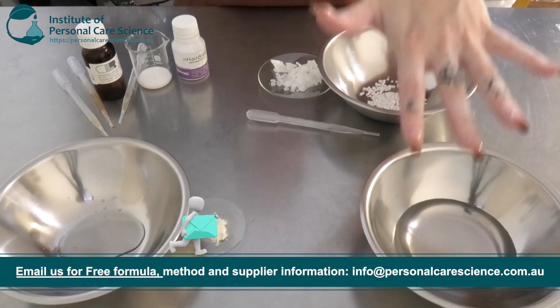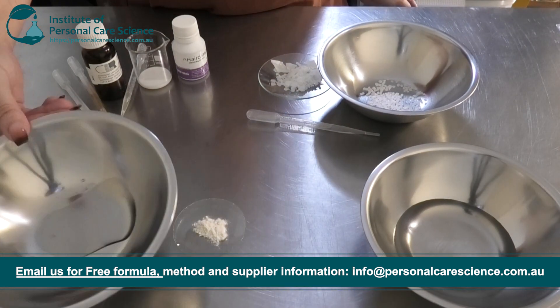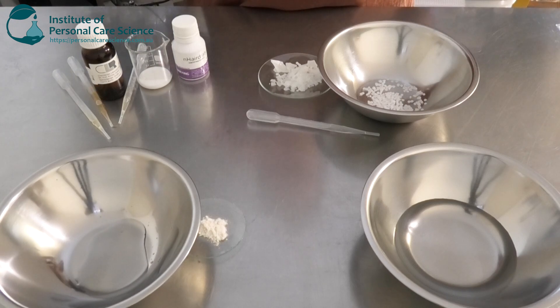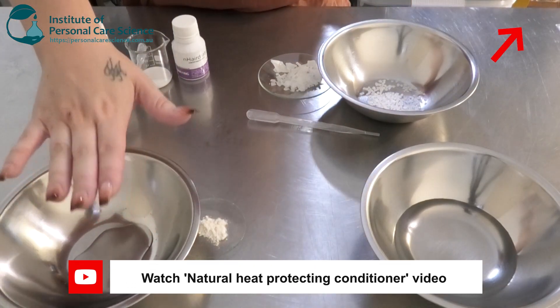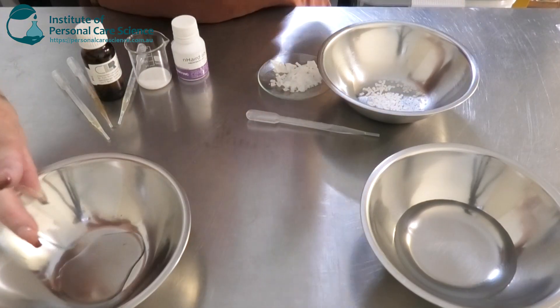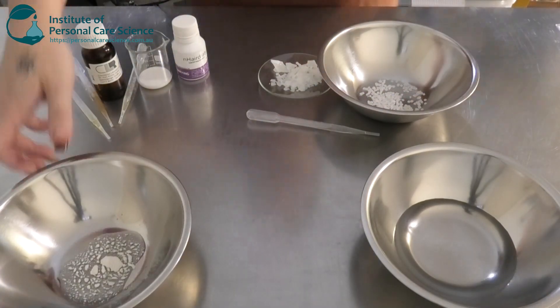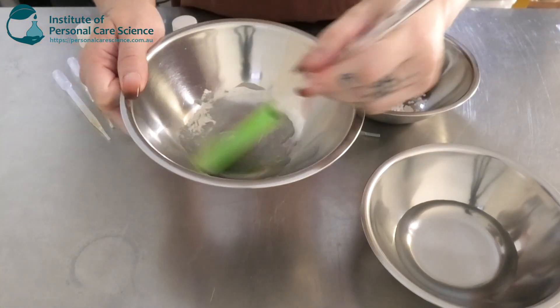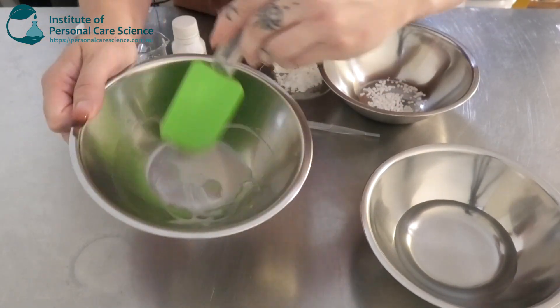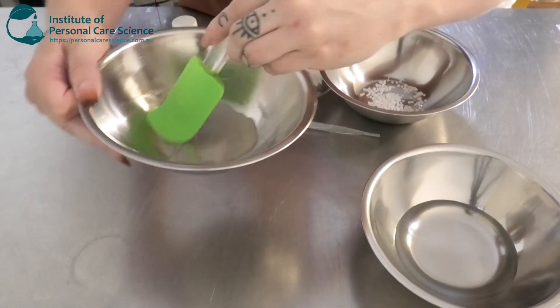Starting off I've got my water phase here, and I'm going to be making a slurry today to help build my structure. I've got some propanediol in here because this is going to be a leave-in product — I don't want anything that's going to be sticky, heavy, oily or greasy. I've gone for propanediol because glycerin can be a little bit sticky in a leave-in. Now to these I'm going to be adding some guar gum. This is going to help build the gel structure of my cream but it's also going to help with creating softness in the hair. We want a nice smooth slurry before we add it into our water phase to prevent fish eyes and ensure that our gum starts to hydrate properly.